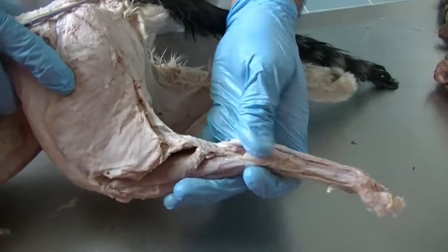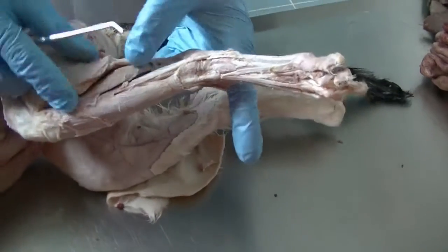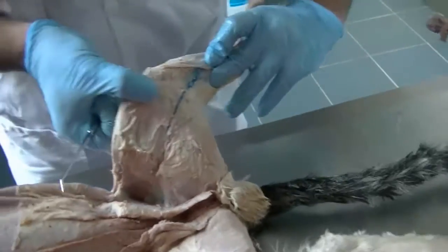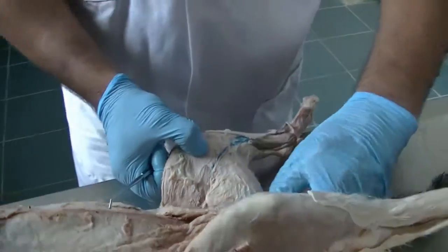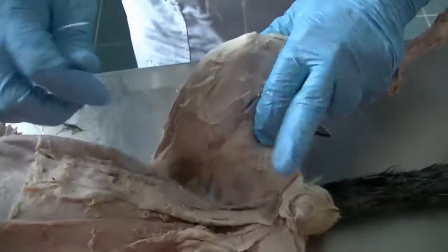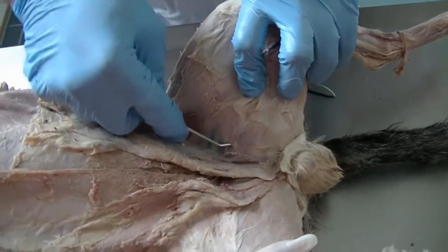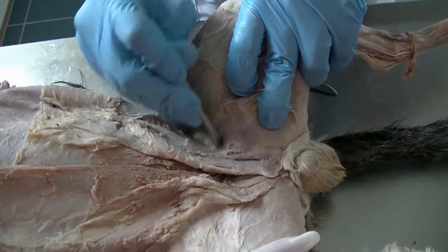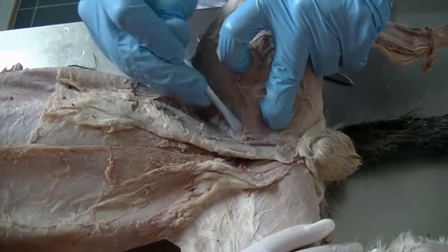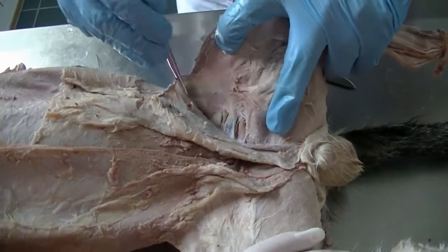Now here we look at some of the flexors of the digit and tarsus in the hind limb. We saw the lateral head of the gastrocnemius, the soleus muscle. As we go to the medial aspect, we're going to observe the same structures: all the muscles which are responsible for adduction of the hind limb are present, including your gracilis, adductor, pectineus. Pectineus is much smaller in the cat as compared to the dog. The pectineus muscle, then the femoral triangle.